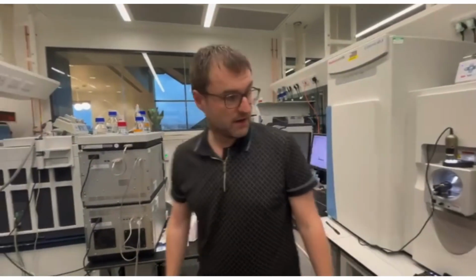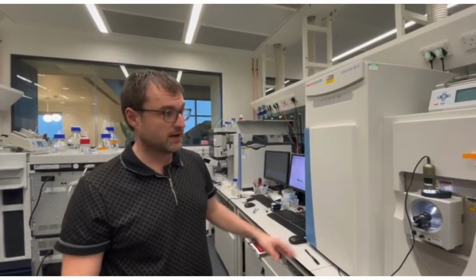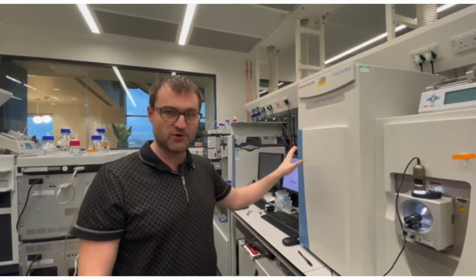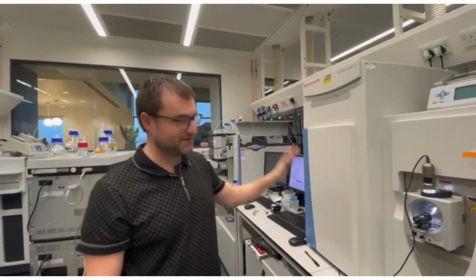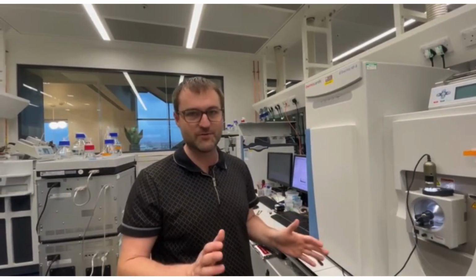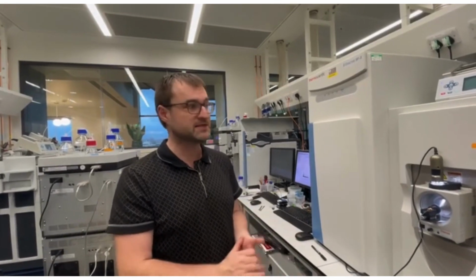All the systems we have here are from Thermo, and they're Orbitraps. There is always a newer, more expensive and more productive mass spec, and of course we all want one, but these still are fantastic systems by today's standard.